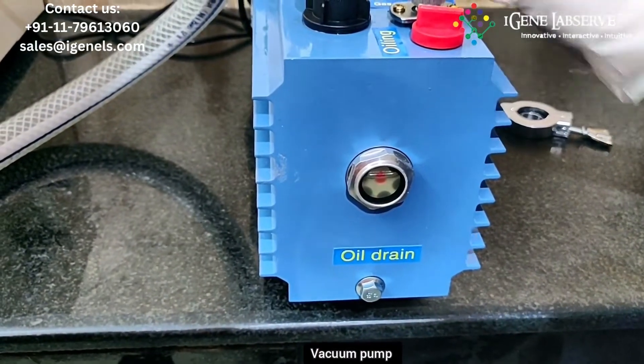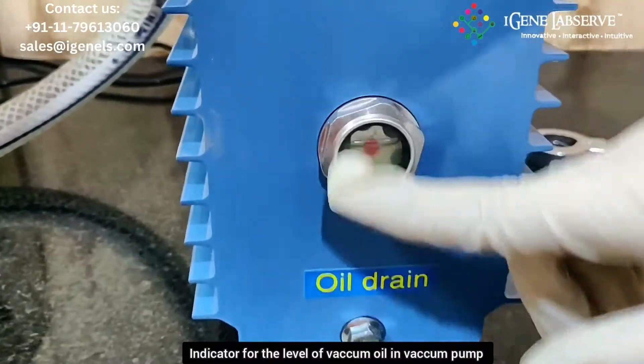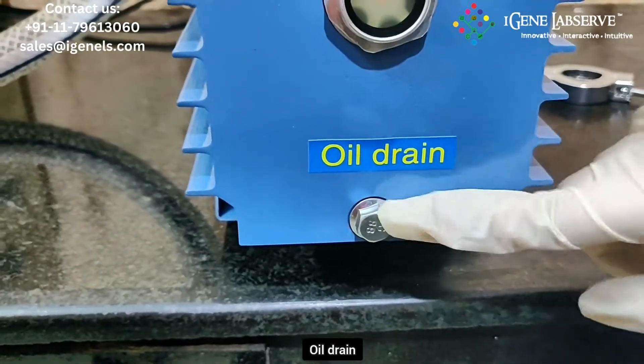It comes with a vacuum pump. This is the opening for filling in the oil in the vacuum pump, and this is the display for the level of oil inside. You have to fill it to 75%. This is the oil drain.